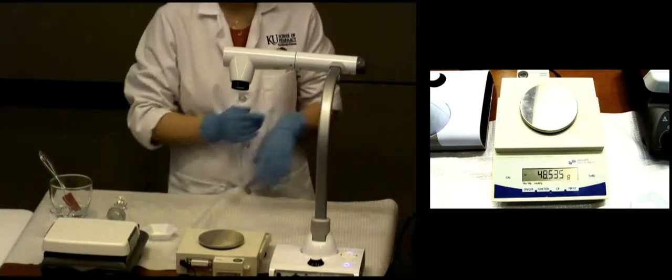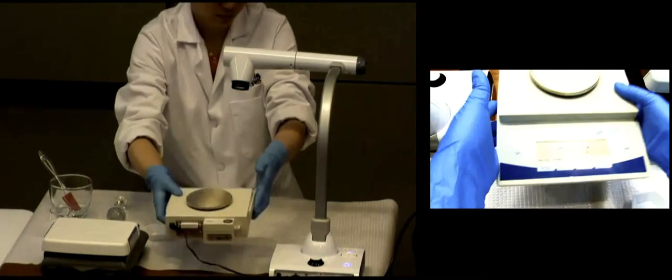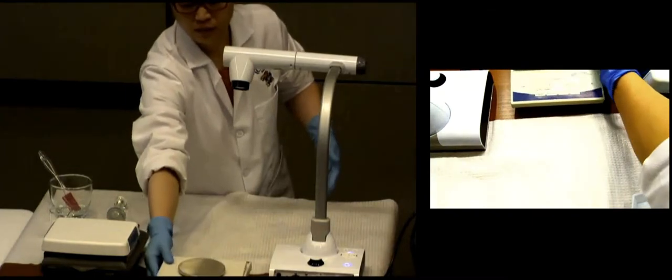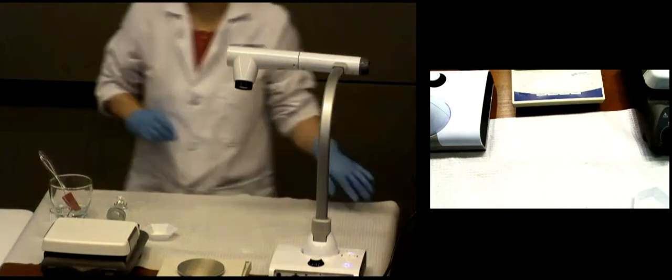So when you go do your polybase out there, realize when you microwave it, it's certainly more stable, but still, don't have just one large chunk or a big chunk and little chunks. Try to make them about the same so that they do melt more consistently. Just a good technique in general.